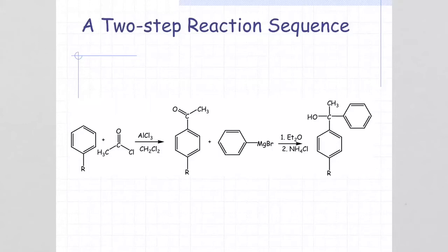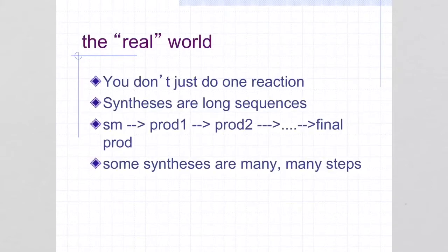Pre-lab for the lab we're going to be doing over the next couple of weeks. It involves a two-step reaction sequence. And in the real world, you don't do just one reaction.